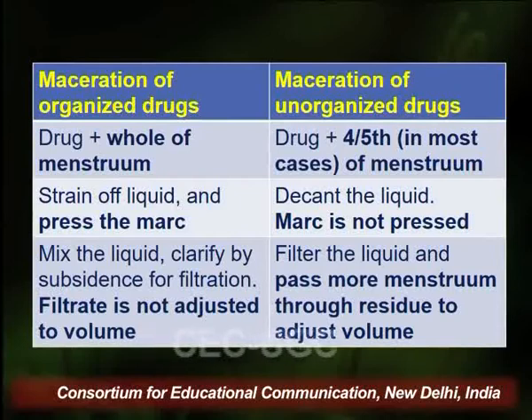Now once the specified time period is over, we strain off the liquid and press the marc in case of organized drugs. We press the marc, we mix those pressings into the main extract, and this is the procedure which we follow while extracting the organized drug. And in the end, we do not adjust the volume of the total extract.